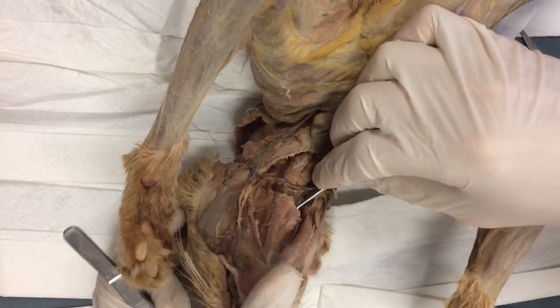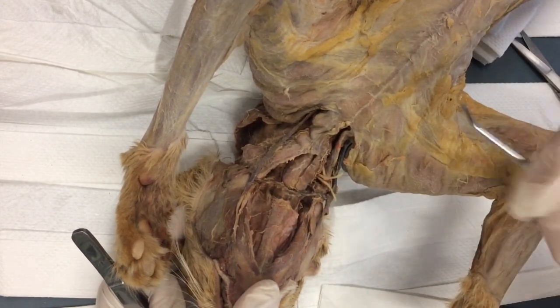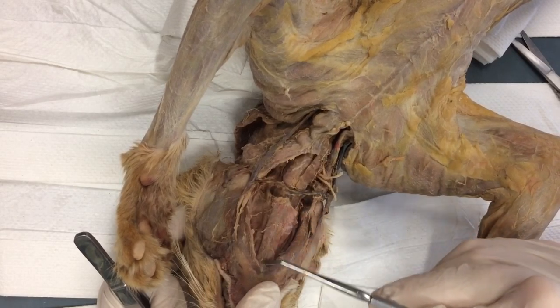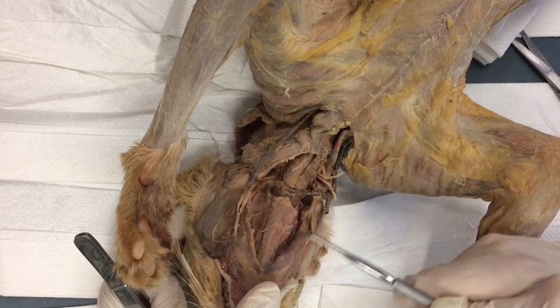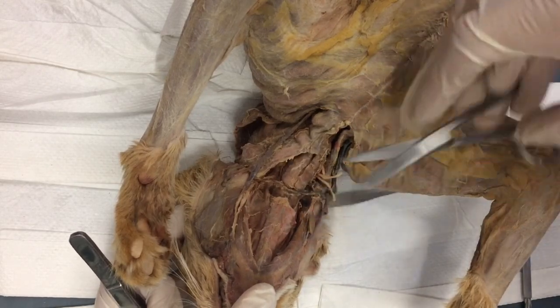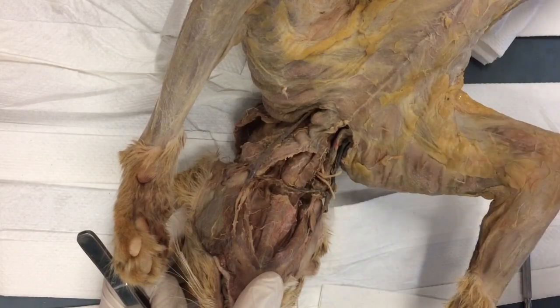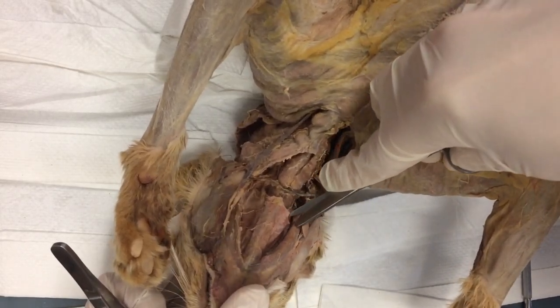Now this is the tricky part. We're going to intentionally cut this. I'm going to do 1/3, 2/3. So you should be able to see a little faint white line going right down the center of this muscle. I'm going to go right down the middle to there. Look at that line. I'm going to cut with my scissors, but I can only do that if I wiggle that free. Watch. And this would be a lot easier if I could spin this cat, because I would have this cat under my armpit right now, but on video, I have to be able to show you this.